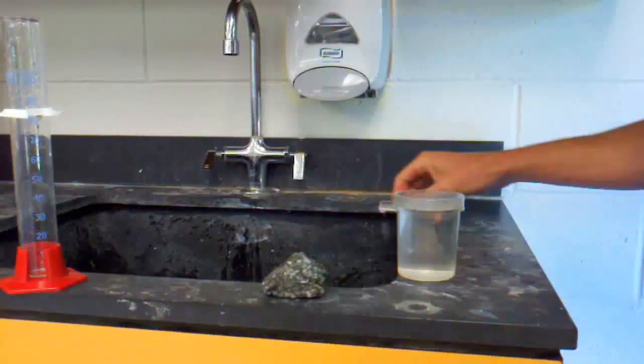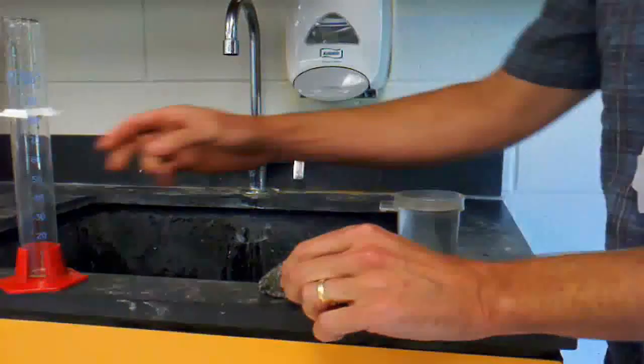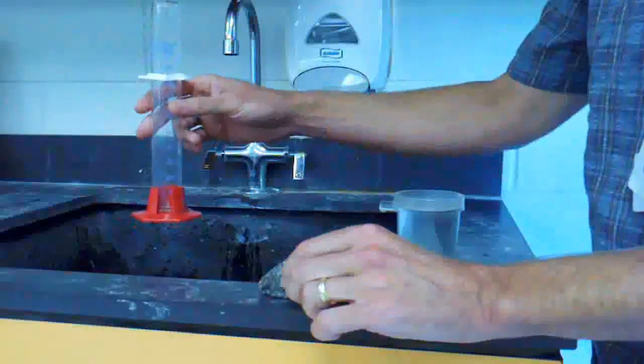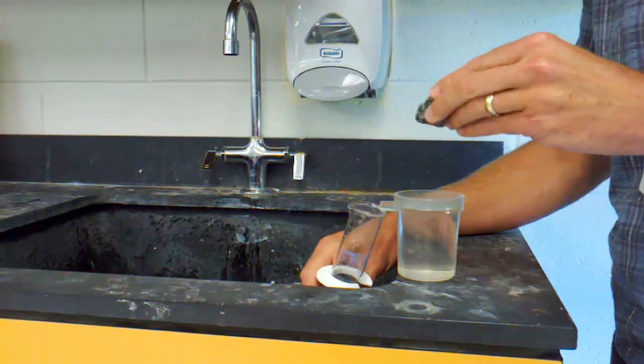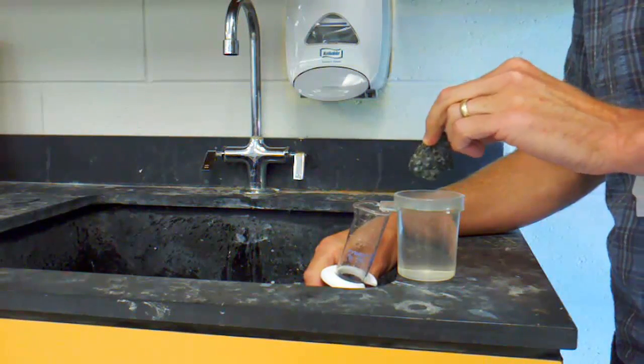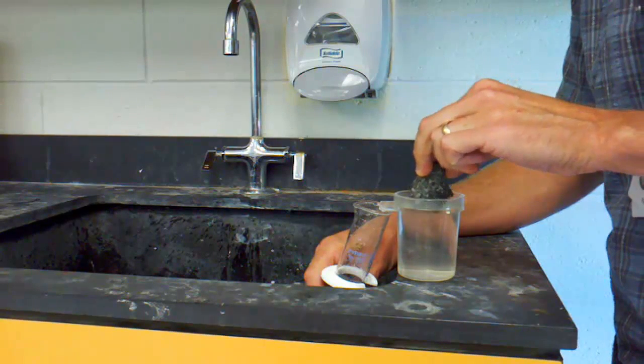Without bumping the overflow beaker, I'll carefully pick up the rock and a graduated cylinder. Holding the graduated cylinder underneath the spout, I'll very carefully and slowly lower the rock down into the overflow cup.